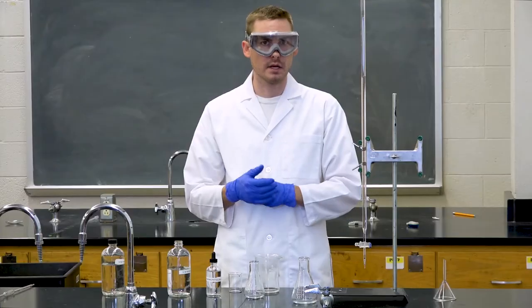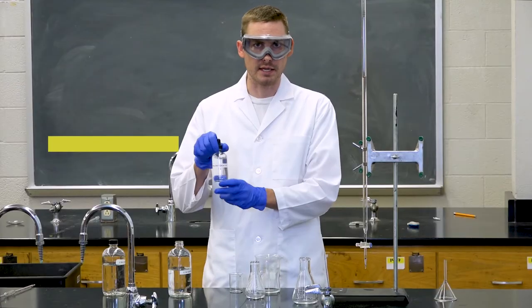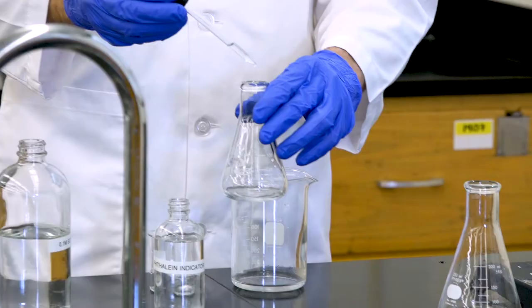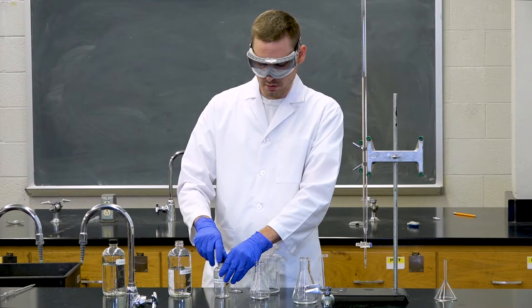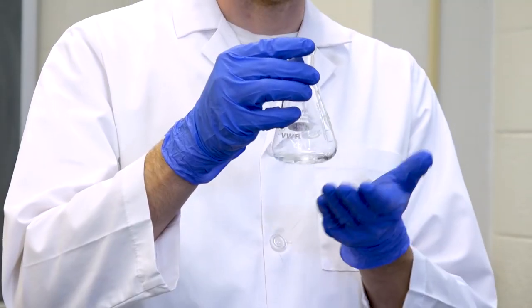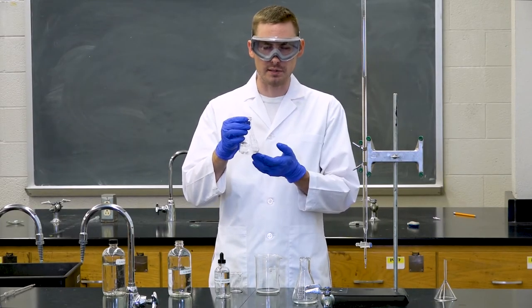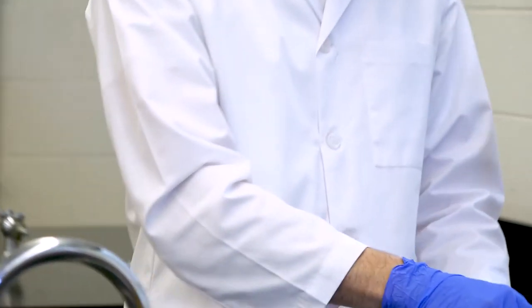the gradations. So once your burette is full, we then need to add 2 drops of our indicator, which is phenolphthalein, to our Erlenmeyer flask before we start the titration. As you can see, there's no color yet because in acidic solutions, our phenolphthalein indicator is clear. But once we add enough base to reach the end point, it will be a faint pink color, and that's when you need to stop the titration.